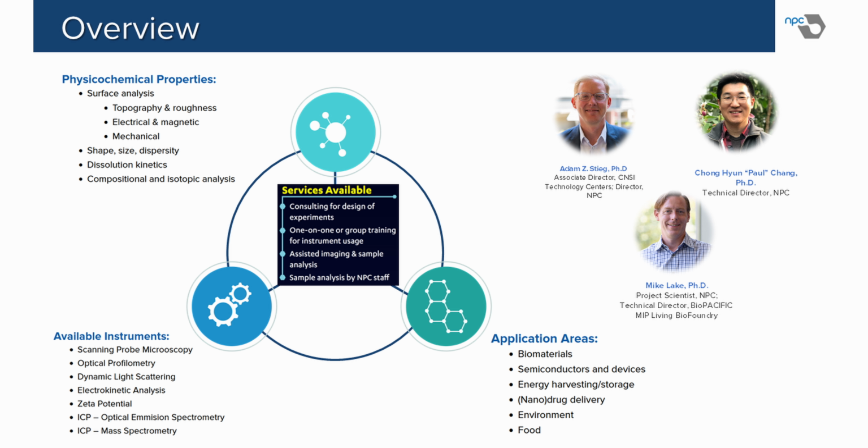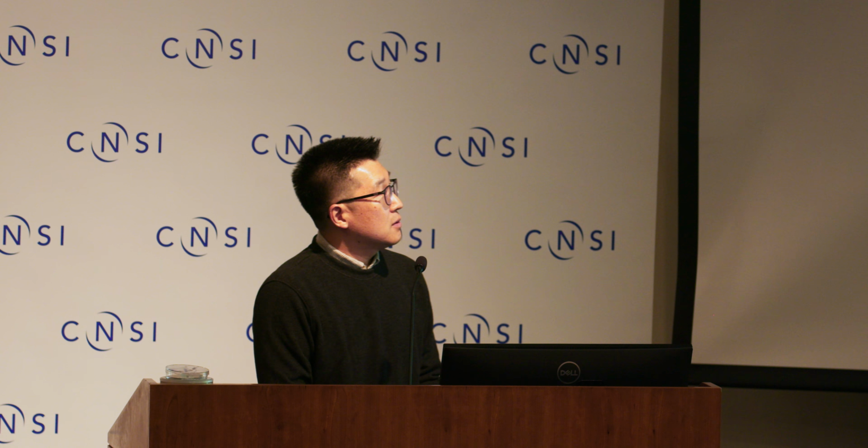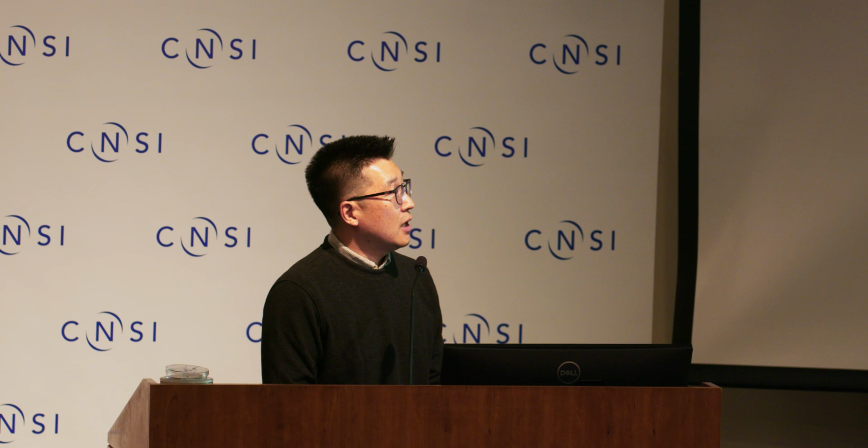And we have three full-time staff: Adam, the director, and myself, to provide the training and technical support, and Mike to focus on the bio AFMs. So we offer consulting on the design of the experiment or research, and also training, in addition to assistance with imaging or data acquisition.